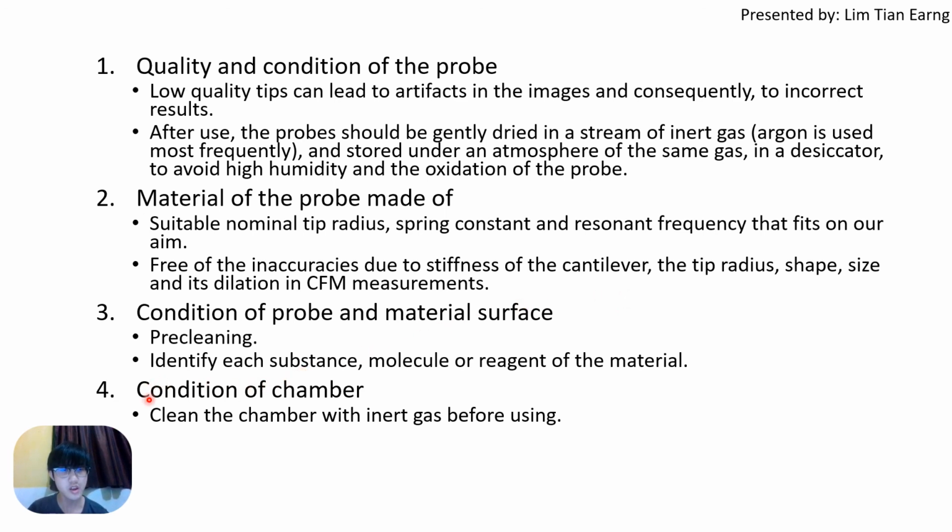So the condition of the chamber: you need to clean the chamber with inert gas before using. This is because before you do the experiment, there may be some substances that live in the chamber, and this will affect your result.